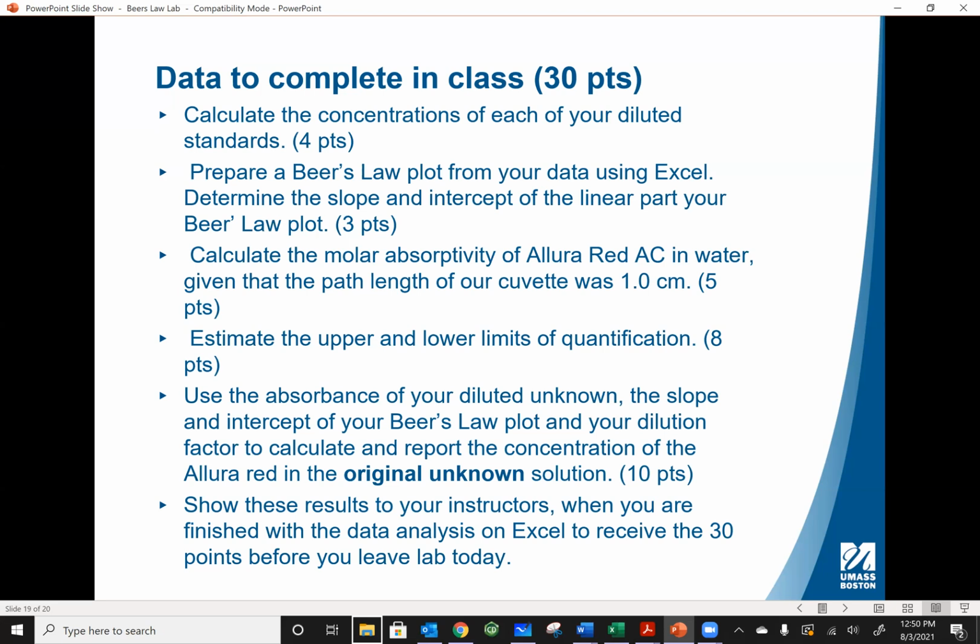So you need to calculate the concentrations of the diluted standards, make the Beer's law plot, calculate the molar absorptivity or the extinction coefficient of Allura Red, estimate the upper and lower limits of quantification, use the absorbance of the diluted solution to figure out the unknown, etc.